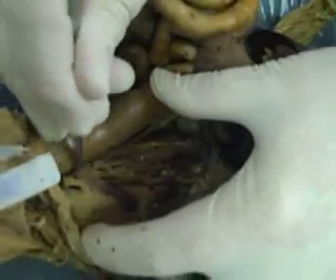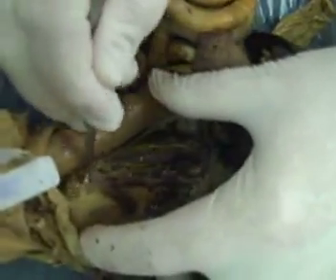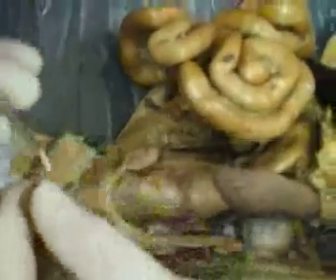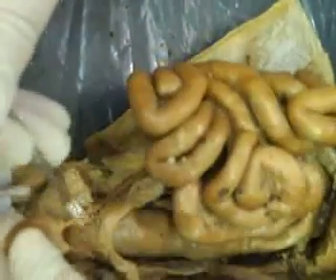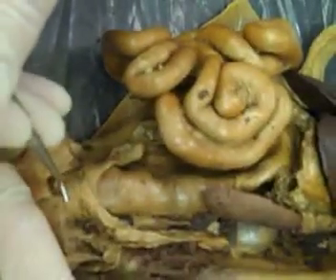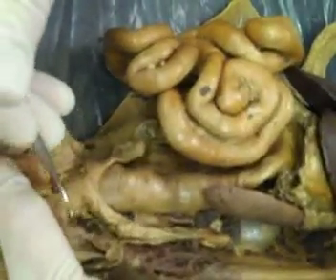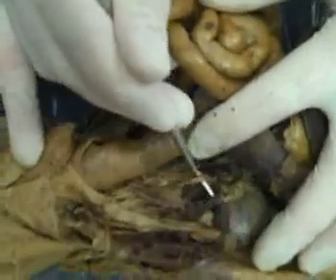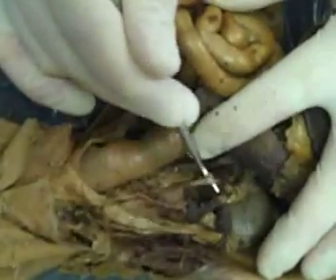See it here, and your bladder's kind of small, but I think we can find, here's where the ureter comes in from the right side, and here's where the ureter comes in from the left side. So that's the same tube right there that I found up here. See how it pulls on it? Okay?